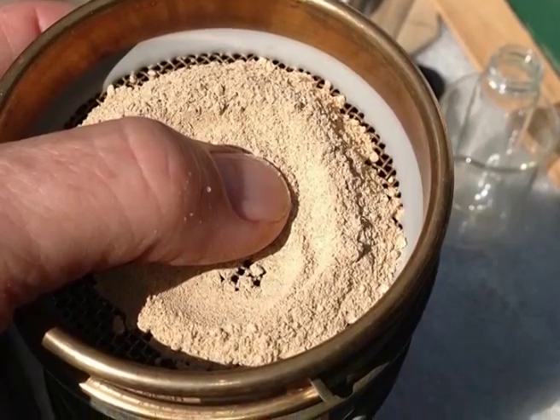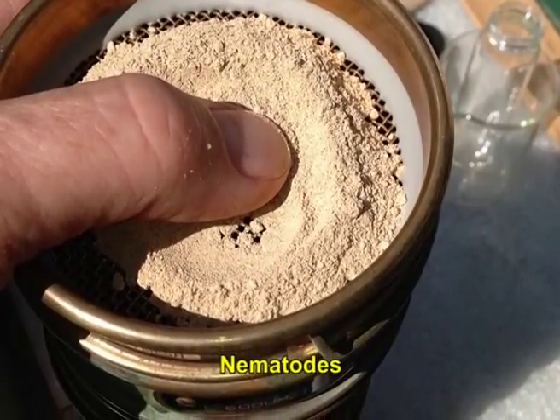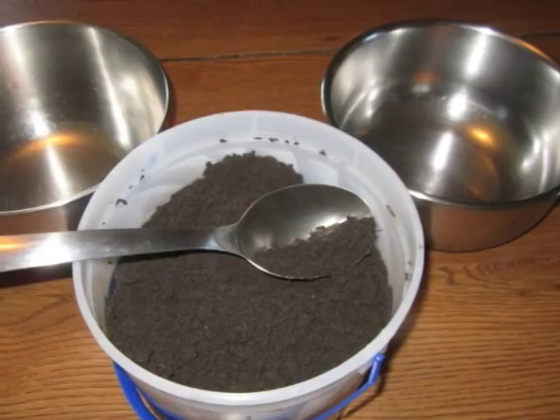Step 2 and step 3 have to be repeated for efficient recovery of nematodes, and after this most of the nematodes will be found in the second bucket. Now the nematodes in the second bucket are suspended by stirring the water. Then the water is allowed to stand for a minute or two, and the contents of the bucket are poured through a 150 or 200 mesh sieve into another clean bucket, avoiding the sediment.